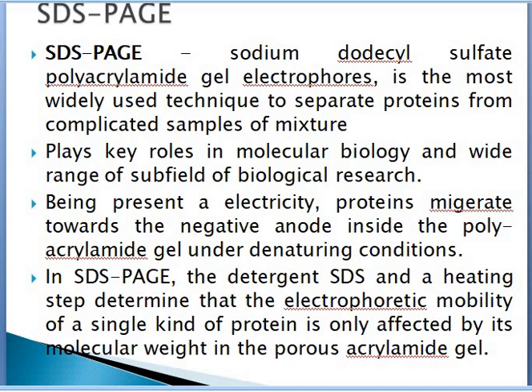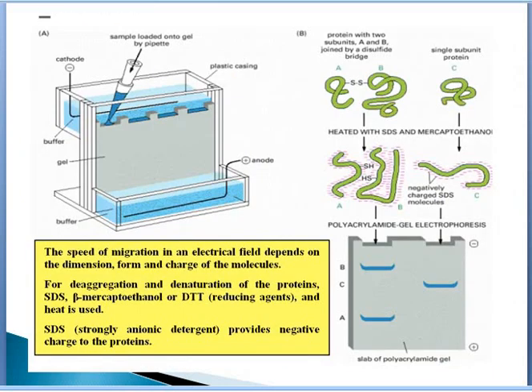So, the separating medium that we are going to use in this technique is called polyacrylamide gel. This gel provides a porous material, and separation is based on the molecular weight. Separation of the particles will be achieved in the porous material called polyacrylamide gel.